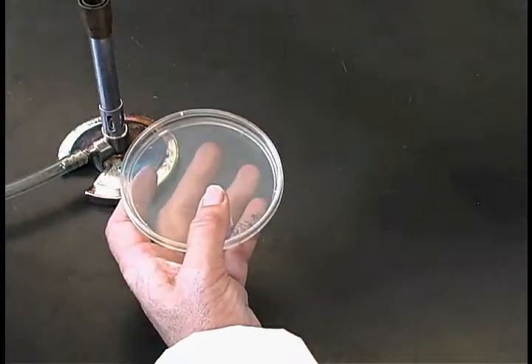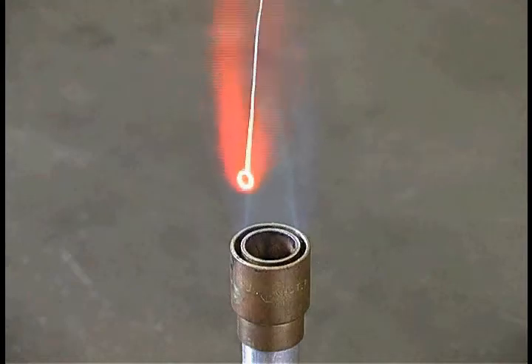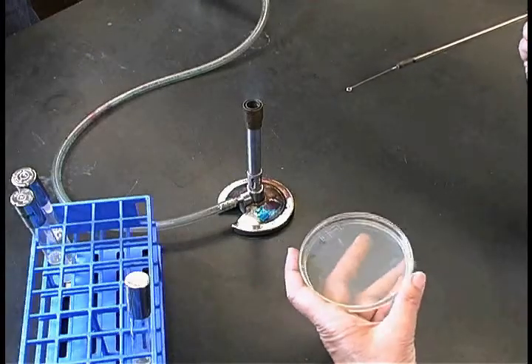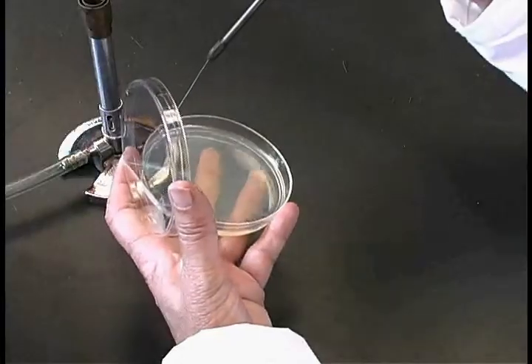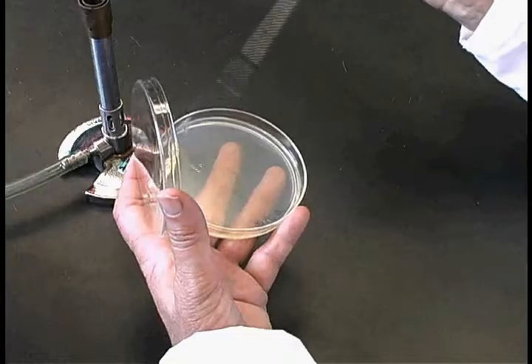Rotate the plate 90 degrees, flame the loop, and without going back into the original culture, streak the culture again on the plate. This time you should go back over the first streak three or four times to pick up some bacteria, and then spread them evenly across the plate.